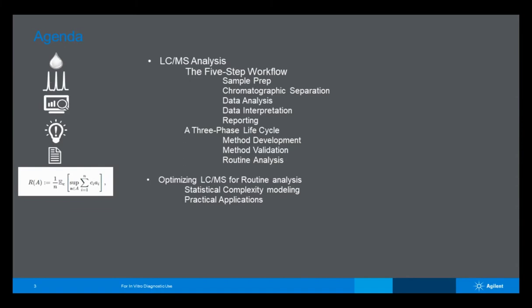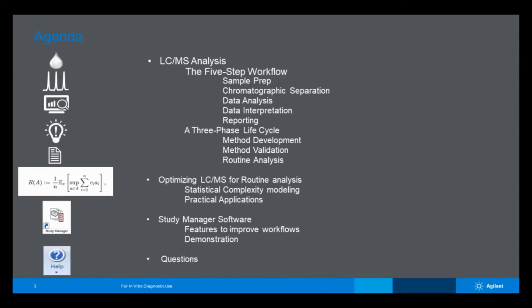Following that, I'd like to talk about optimizing LCMS for routine analysis, looking at that through the lens of a statistical complexity, or modeling it as a statistical complexity, and where the practical applications of that model come into play, specifically utilizing our Agilent Technologies Study Manager software, which has features to improve your workflow, and a demonstration as well. So that's the agenda. Finally, we'd also like to have question and answer available for you as well.